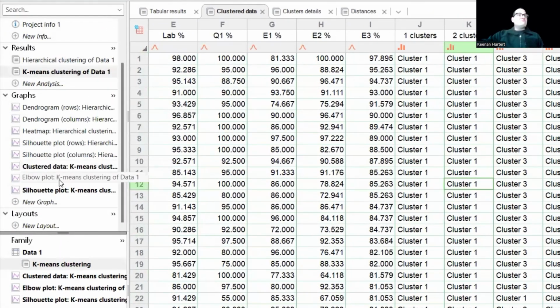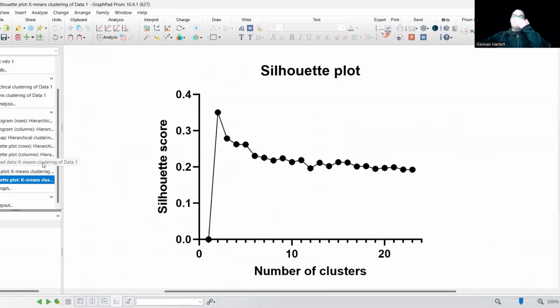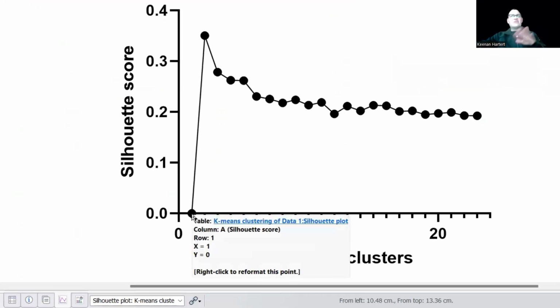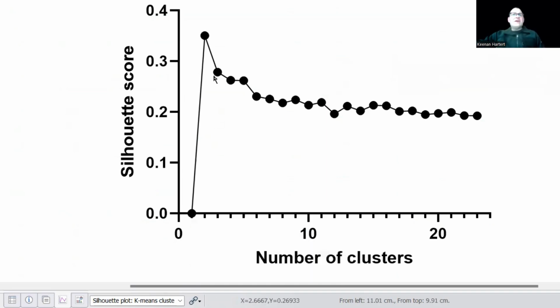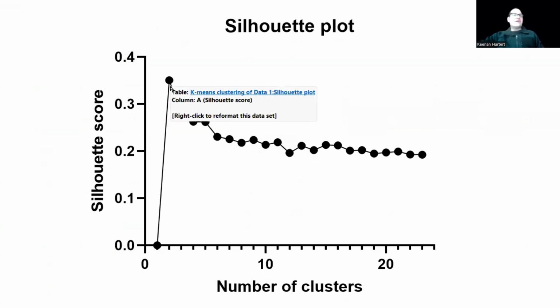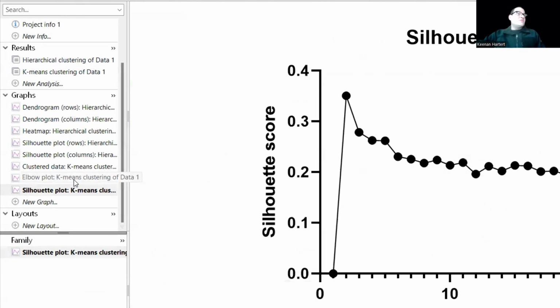All right, so given everything, let's take a look at our silhouette plot. Like we saw before, it tried a lot of different clusters. One cluster was terrible. It clearly needed to have different stuff. Three clusters wasn't bad, but two is the healthiest setup in this case. A lot of my cancer research is plugging in patients and their genes and seeing who shows up. A lot of times in what I research in lymphoma, it's going to be five clusters. But however the data shows up, it's going to be hypothesis generating. So right now I would say, all right, I am backed up by k-means that says my data exists in two main primary groups.